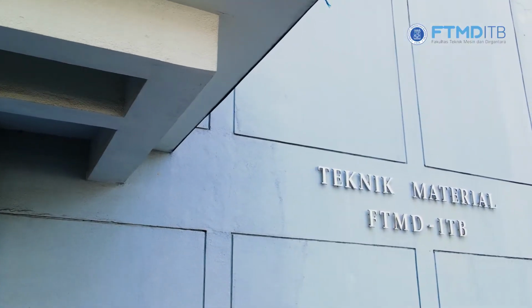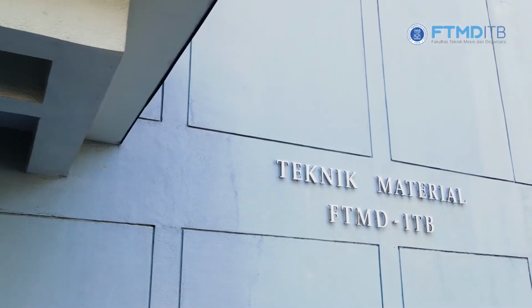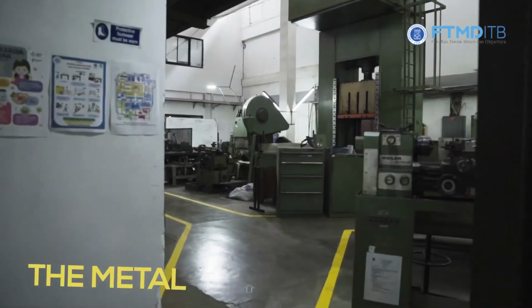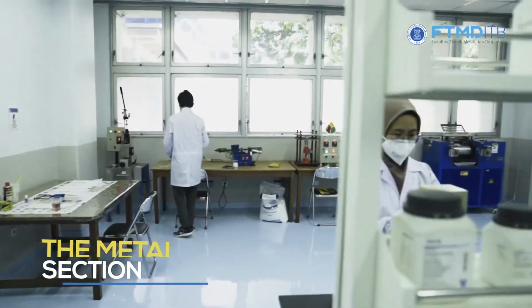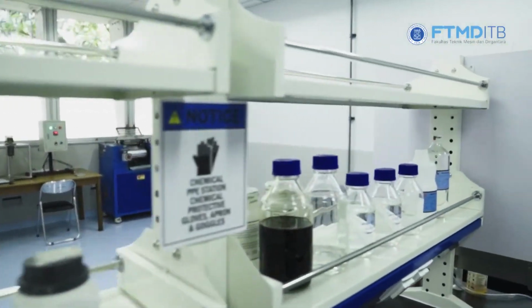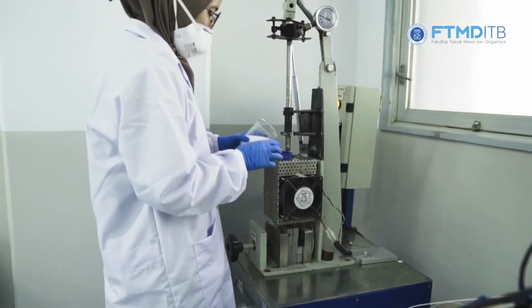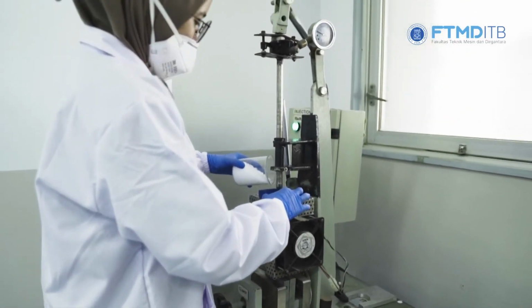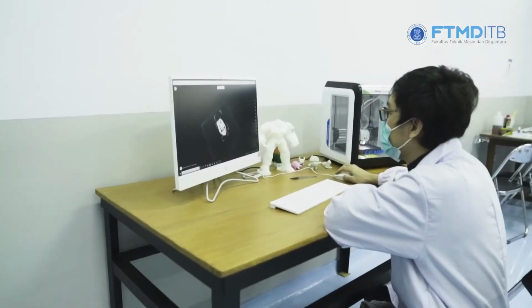The Materials Engineering program has a Materials and Metallurgy Laboratory, which is divided into two parts, the Metal section and the Polymer and Composite section. This lab is used for teaching, learning, and research activities. Students can carry out activities in the laboratory to support learning activities in the classroom.